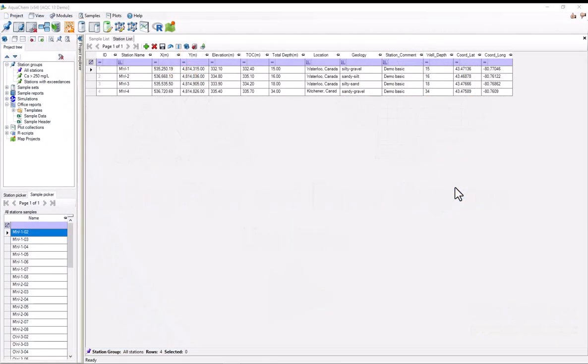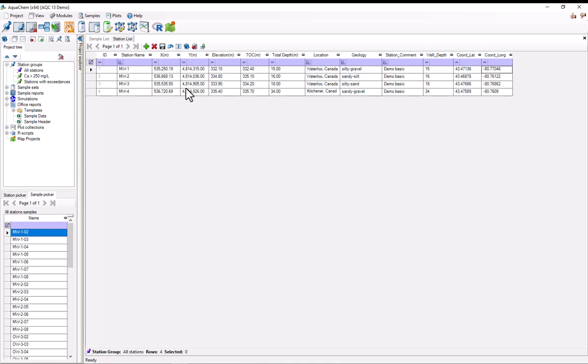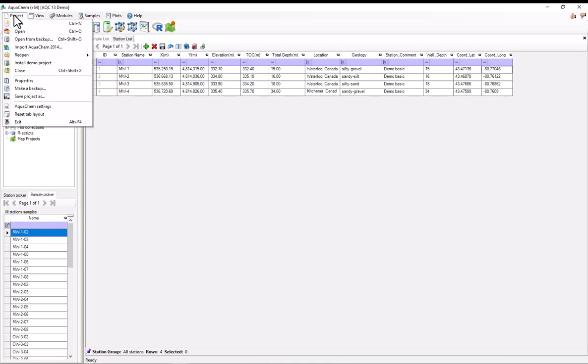Hello and welcome. In this video, I'll be showing you how to create Piper diagrams and Durov plots in AquaChem. As you can see, I have a project loaded that has data already on it. Incidentally, for this video, I'm using the AquaChem demo project, which you can install by going to the project menu and selecting Install Demo Project.